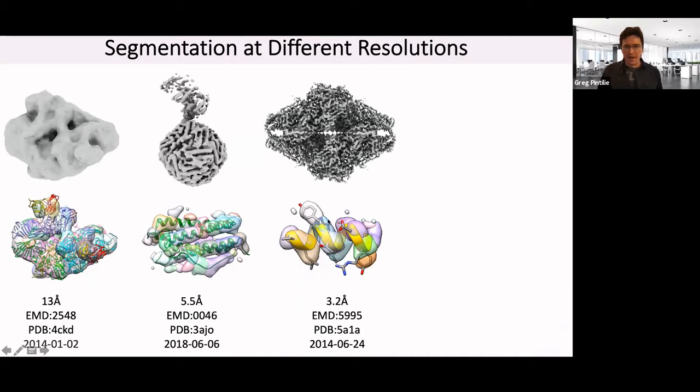In maps like this, you can see that some side chains, like this tyrosine, tend to be resolved at this contour level, whereas there might be some other more dynamic side chains, like this arginine, which actually has no segment there. Now, this is also based on this notion of a threshold. When we visualize that, the threshold still comes in. So if I lower the threshold, maybe I'll start to see something. But generally, if you lower it too much, you start to see a lot of noise. You start to see some of the smaller blobs, for example, here.